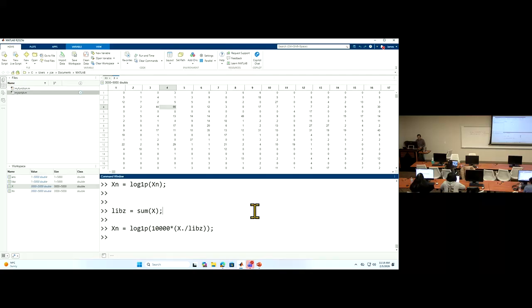Okay, now we will be focused on the normalized version. We can put x aside, and now we are working on xn, the normalized version. Now you compute the average expression of each gene. So you have xn, and now we compute it in terms of gene-wise.